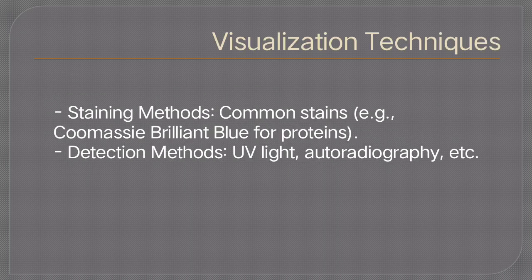Visualization techniques. Staining method: common staining includes Coomassie brilliant blue for protein. Detection methods: UV light, autoradiography, etc.